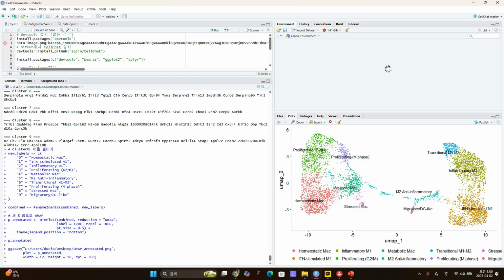So like that, you analyze the data set this time, and you guys can put this data set in the paper, in the supplementary. Also bacteria as well. For bacteria, you can find bacteria sequencing data, single cell sequencing or anything.